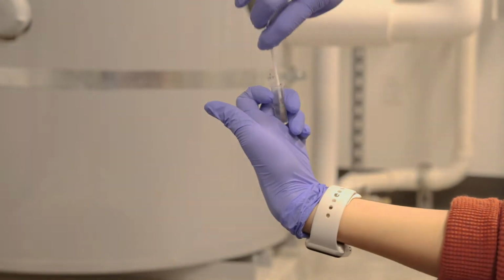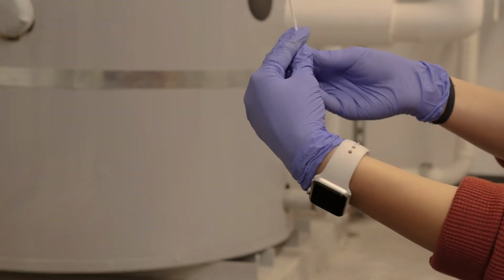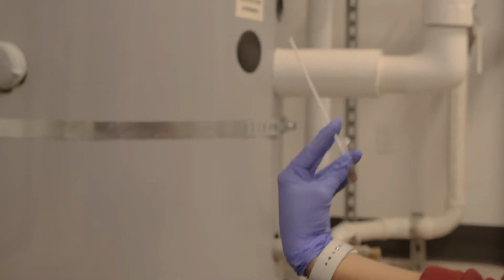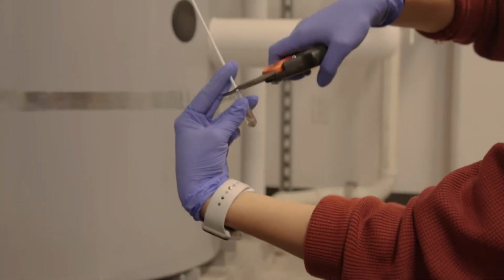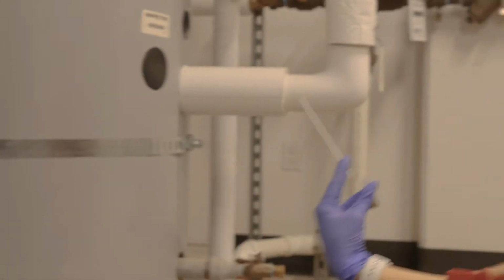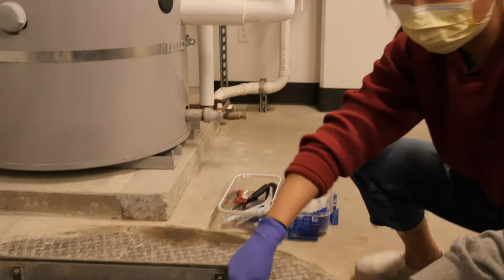Swab face down. Using my index and middle finger, I'm going to lift up the swab slightly and then snip and close the lid. And we're done. So you're just going to carefully lower that back down. Don't splash. Did the liquid disappear? Yeah. Oh.